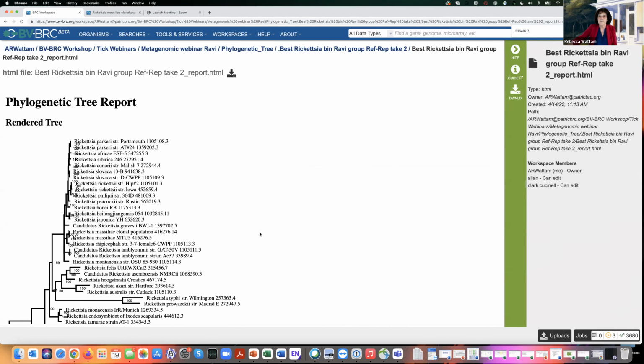Okay, let's take some more questions before I go to the next one. Okay, so there are, I guess, two more general questions. So one is about using specifically 16S amplicon metagenomic sequencing. And the question is, this is again from Claudia, can she build a tree based on those? And can she get any functional predictions from the 16S?